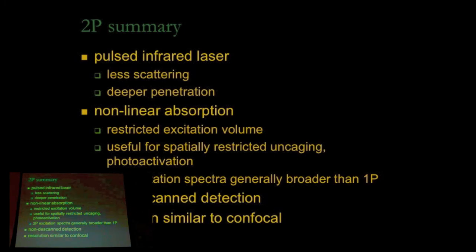But that bleaching can cause photo damage, because bleaching typically involves an oxidation event. And so, as you said, because you're getting all of this out-of-plane fluorescence with just a single 1-photon system, as opposed to this very punctate spot, proportionally, all other things equal, you're going to get more damage with 1 photon, because you're going to get more bleaching.